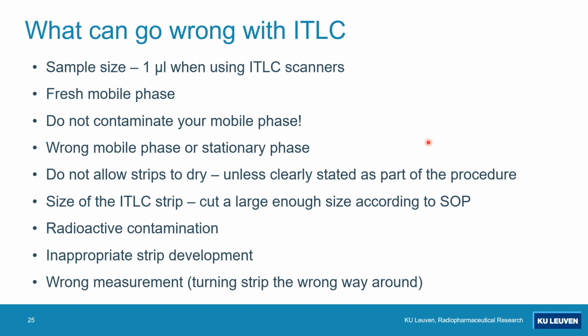If you touch the strip at the wrong places and contaminate it with radioactivity before you run it, or inappropriate strip development and wrong measurements. I've seen people measure the strip the wrong way around or stuff like that. So please concentrate when you do your ITLC, and you can make sure that you do the right thing.